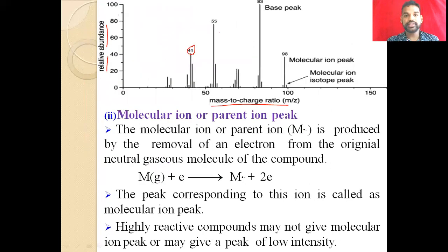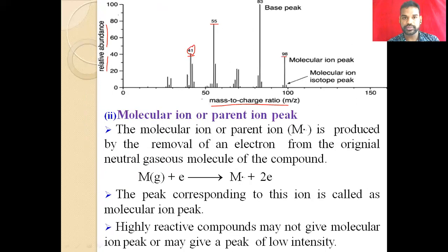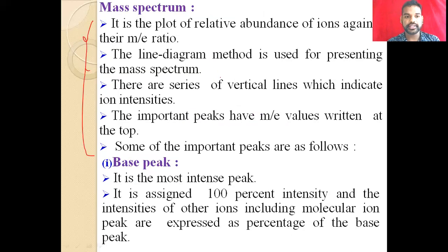We have a lot of peaks here, but only the important, characteristic peaks are labeled with the molecular mass or m/e values. So this is very important.